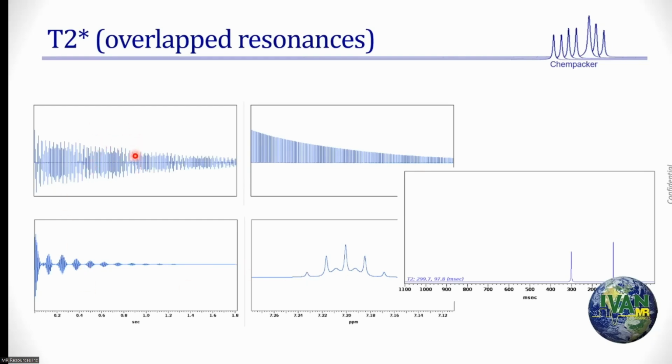So what is this? That's actually time domain analysis. When I say time domain, I mean frequency, amplitude, decay rate, phase of this FID, the one at the bottom, after I shift 100 points at a time. The first line is the FT result of zero shift, no dwell time shift. And then the next one is 100. Actually, maybe less than 100. I don't remember now. X number of points shift.